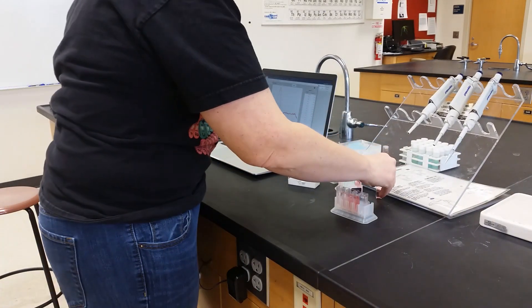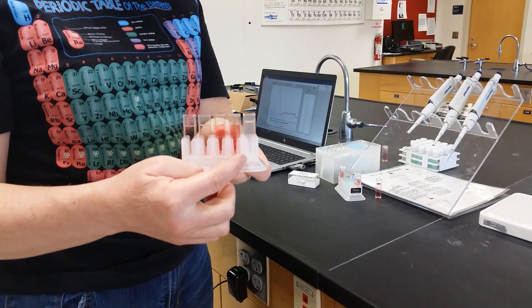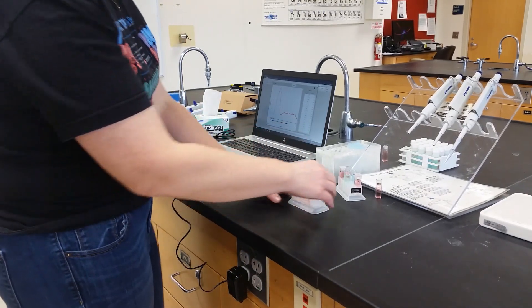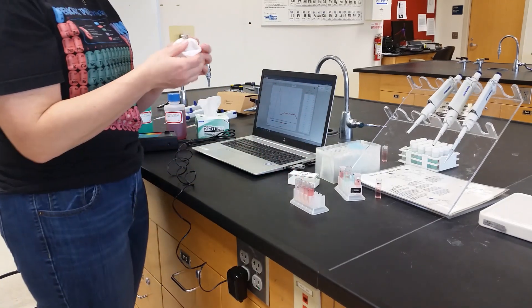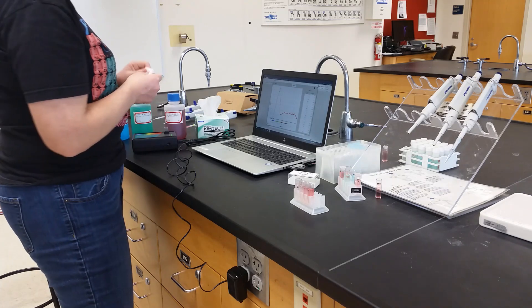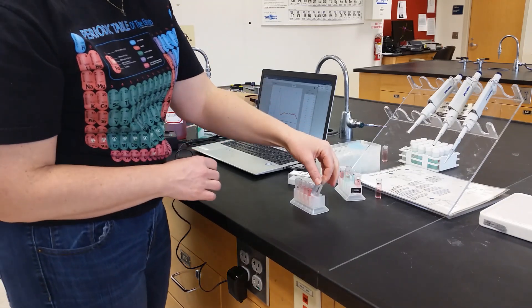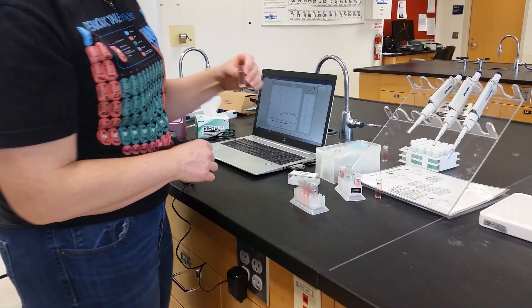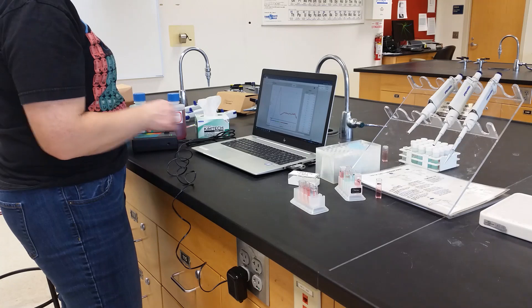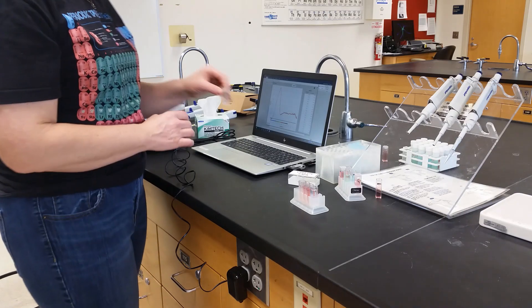We should now have stock solutions that are in different concentrations, and the shade also differs. We're going to finish our calibration by putting our blank DI water into our spectrophotometer after we have chosen the absorbance versus wavelength experiment. Finish the calibration. We put the lowest concentration, which is standard one, into our spectrophotometer. We hit collect, and stop, and rename our data set.